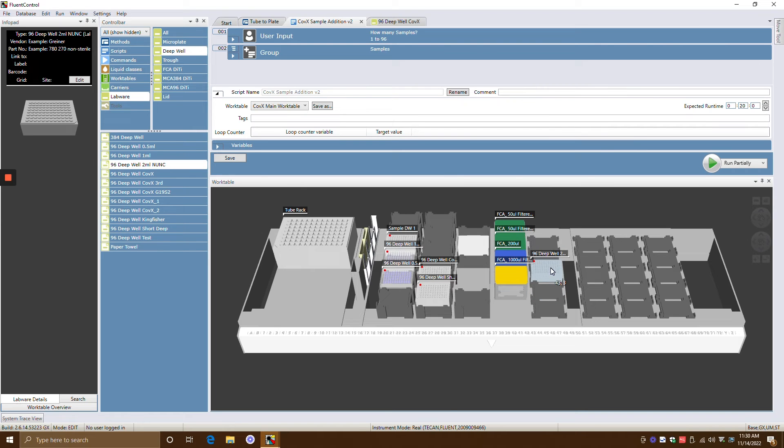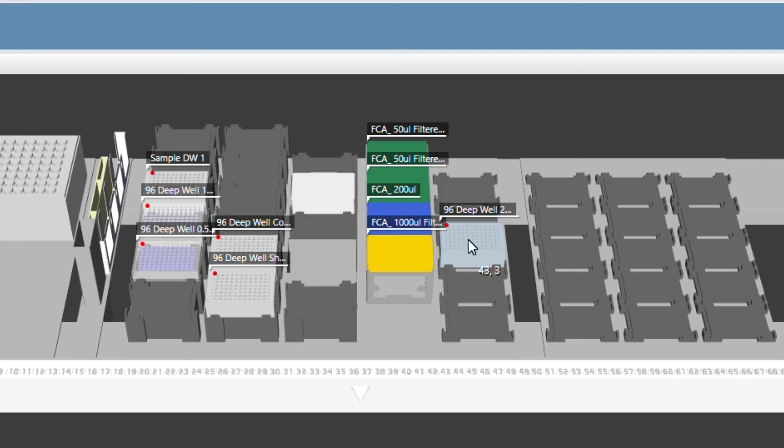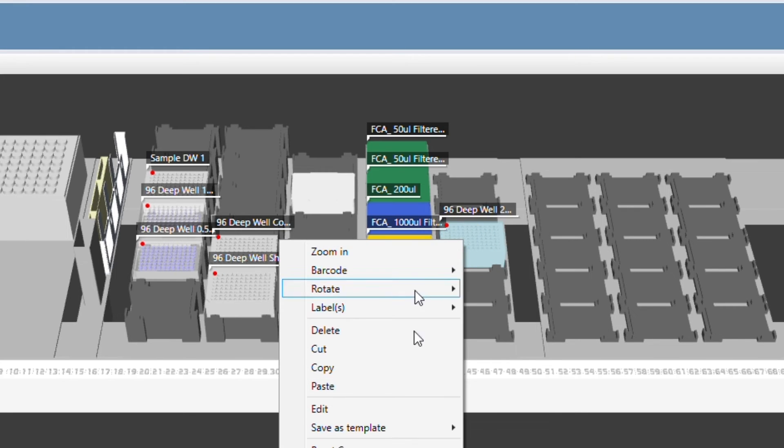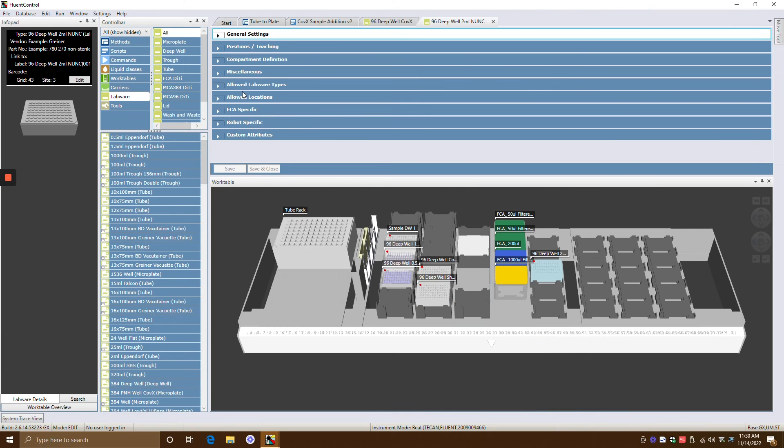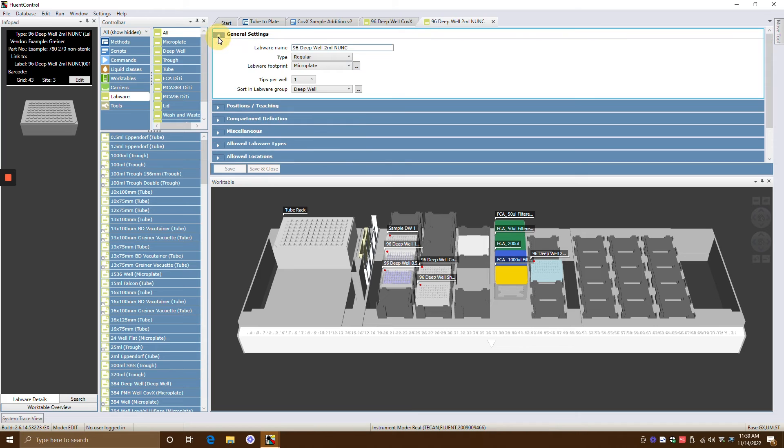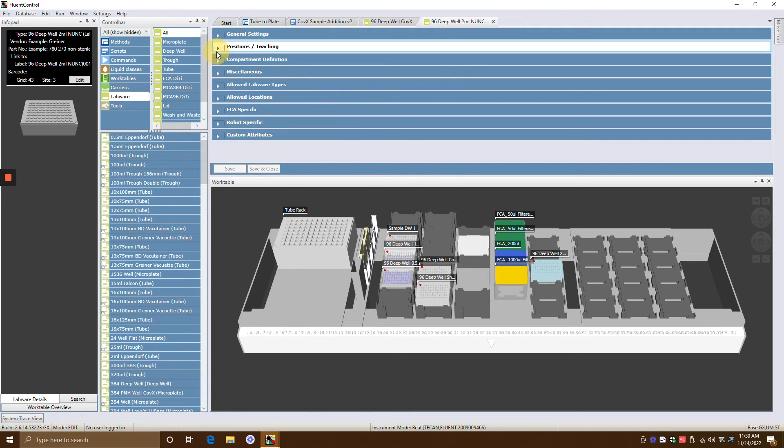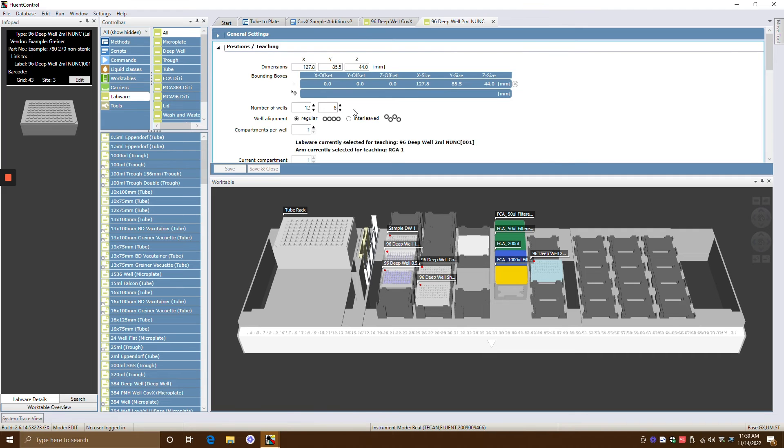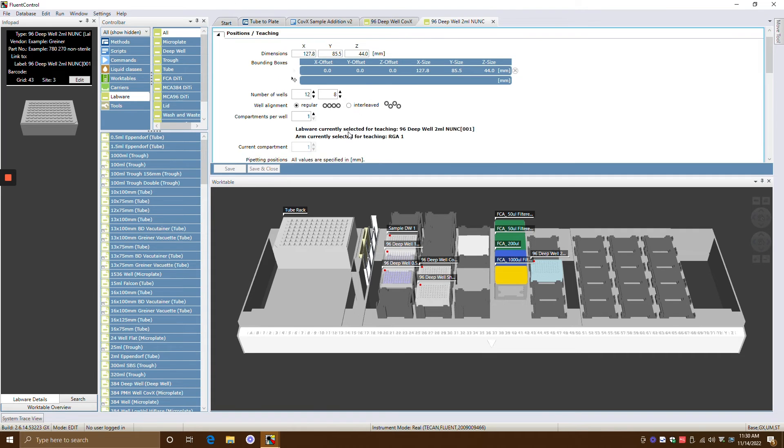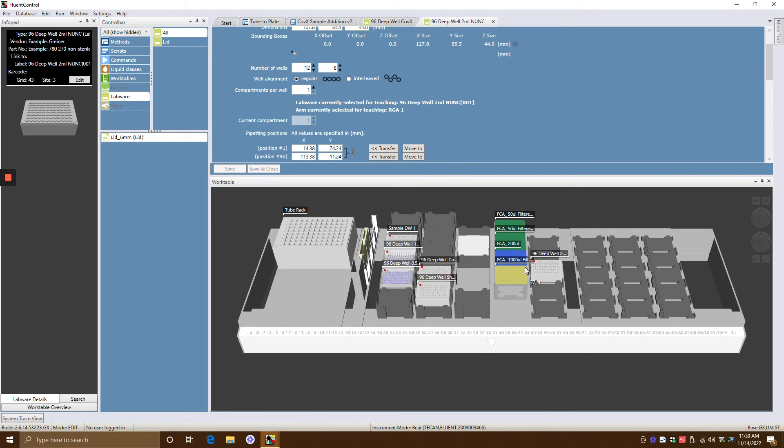And then if you wanted to edit the specific labware, if you wanted to change the name, you could just right click on that and click edit. And then you can do your general settings where you can name it whatever you want. You can do the positionings and position it however you want.